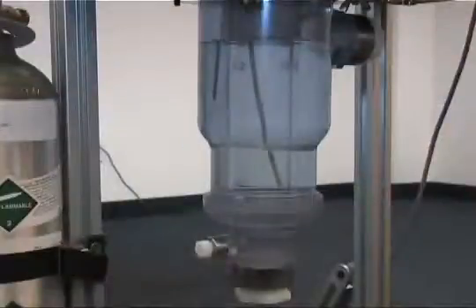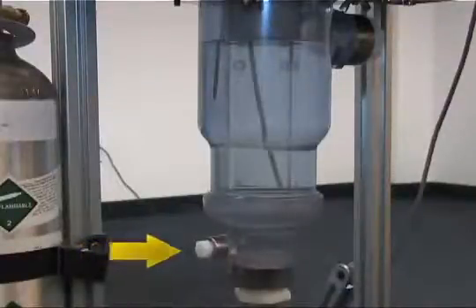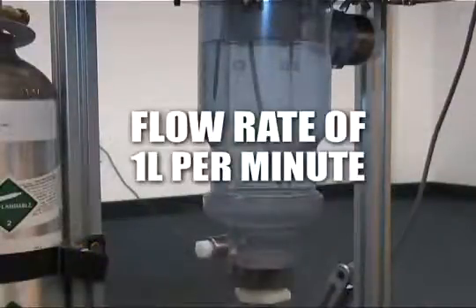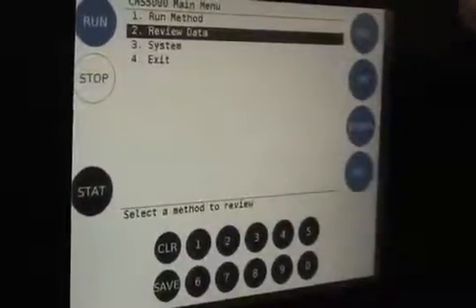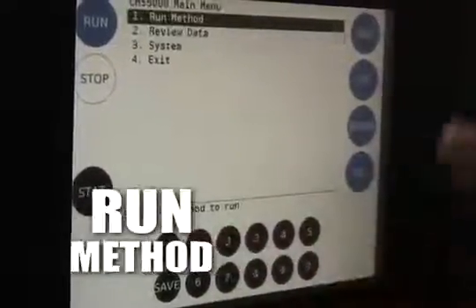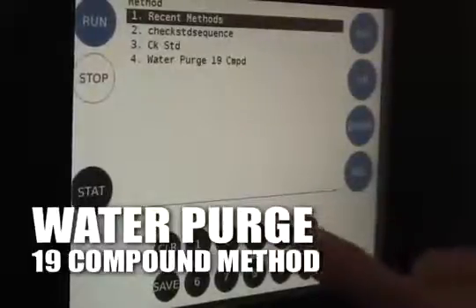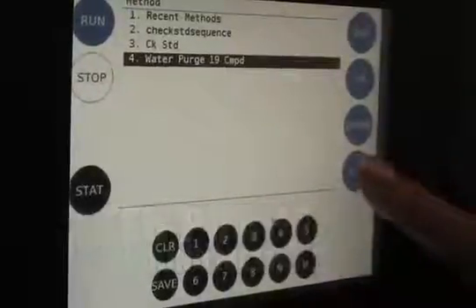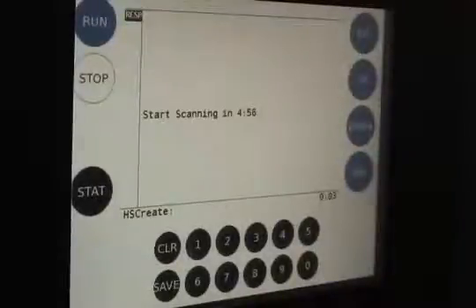When sampling continuously, the water enters the input into the 1-liter sample vessel at a flow rate of 1 liter per minute. The water exits the upper part of the vessel and flows into the waste drain. Use the ESC key to return to the main menu, select Run Method, then select Water Purge 19 Compound Method. The water purge method contains 19 compounds, including trihalomethanes and some EPA chemicals of concern.